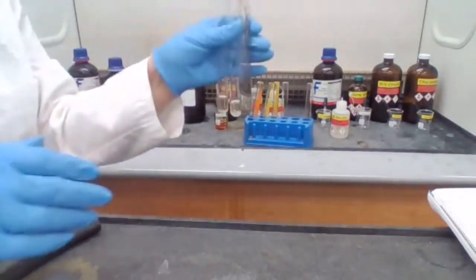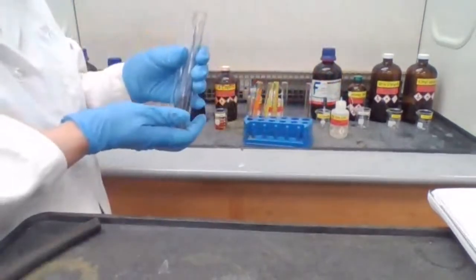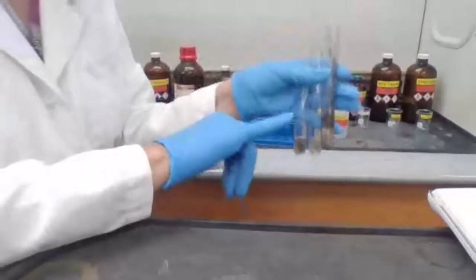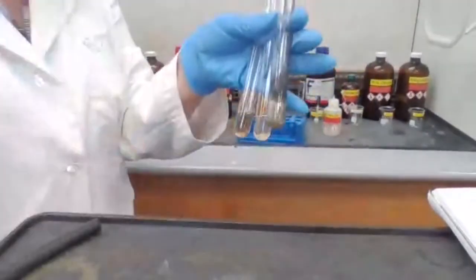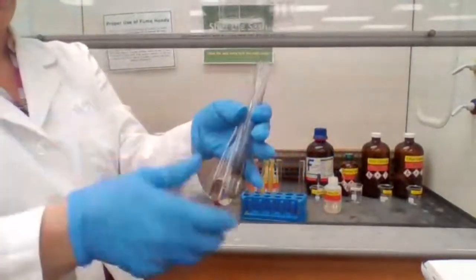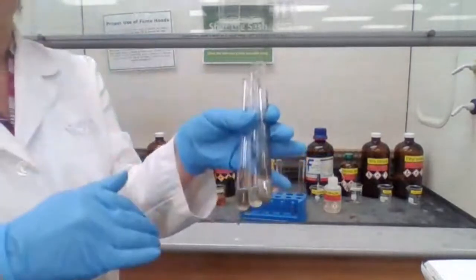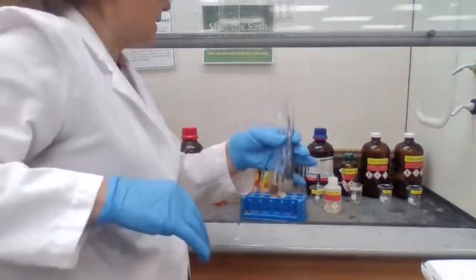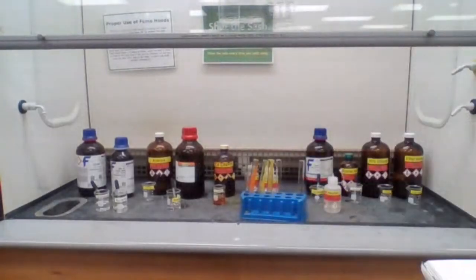We need to wash these with acid right away because you don't want to leave the Tollens reagent. If it dries out, it changes to an explosive compound and is not safe. So I'm going to take care of washing this part first before I continue with the rest of the experiment. Okay? I'm going to use some acid to wash them first.